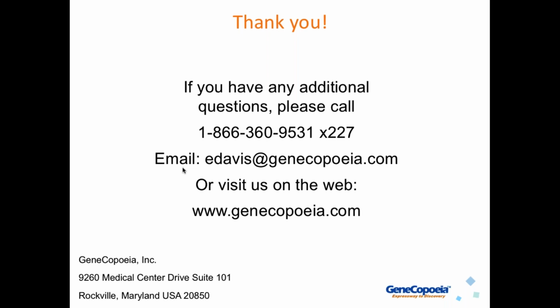Okay, next question. Does your ROSA 26 donor use the native promoter? Actually, it does not. Some people do safe harbor knock-in where they'll have a transgene that's utilizing the endogenous ROSA 26 promoter. That can be true of AAVS1 as well. But the knock-in constructs I showed you, at least the pre-made ones, usually use the CMV promoter, or they might use the CBH promoter to drive transgene expression. But we can certainly make safe harbor knock-in donor clones that utilize the endogenous promoter for transgene expression.